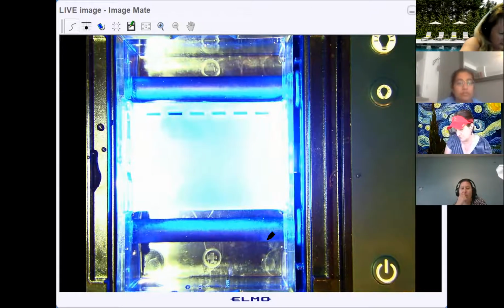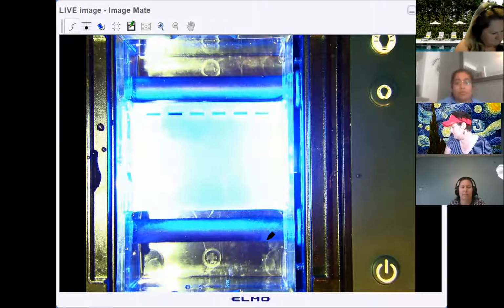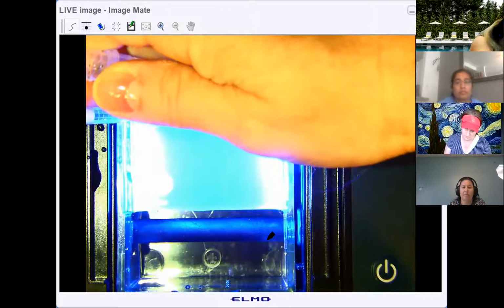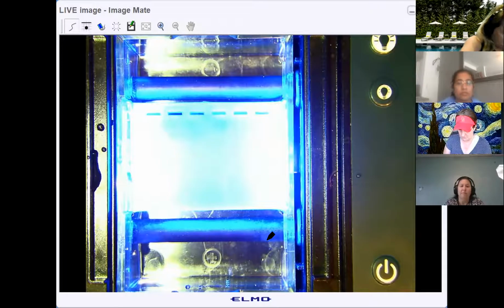And then in the next well, we're going to put Mom. Next, we're going to put Dad. And I'm changing pipette tips each time so we don't have cross-contamination.